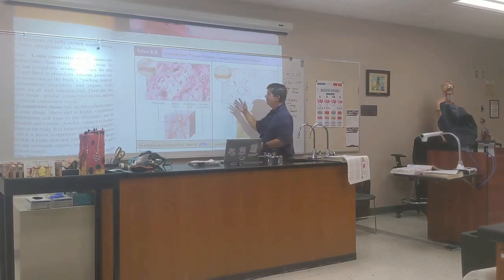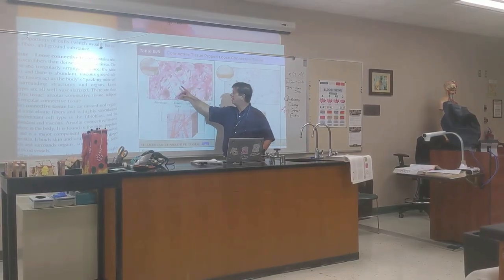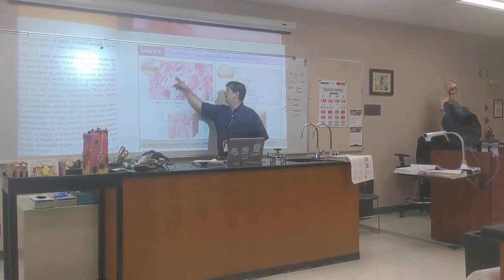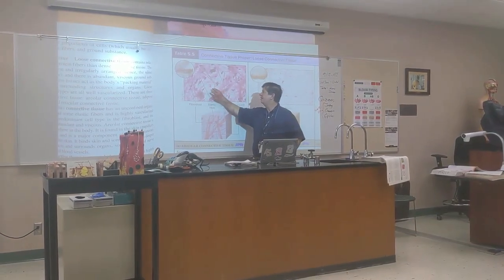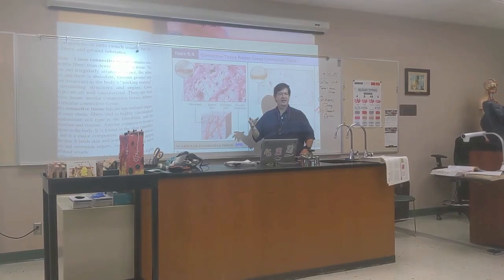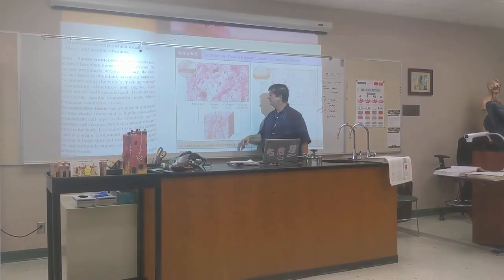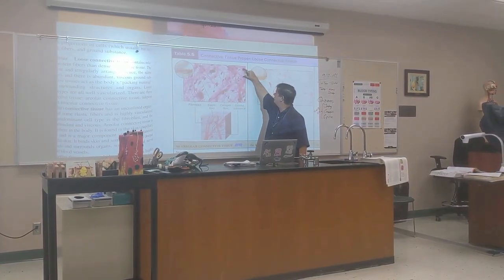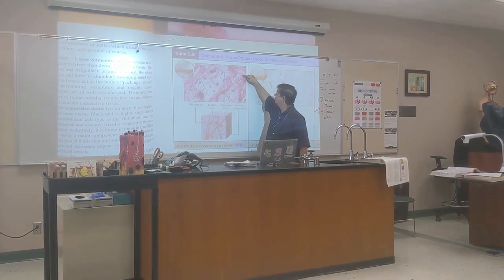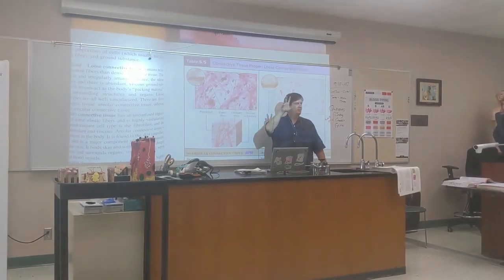But this is areolar connective tissue, and it looks very open, like there's nothing there. Like you've got fibers for sure, and you've got specialized cells living there. This is not nothing. This is not air. This is ground substance. There are things there. Does that make sense? But it's got a lot of space. And when you look at this areolar connective tissue, it has elastic fibers, it has the bigger, thicker collagen fibers. See how here the elastic fibers are thin, little stretchy things, and then the thicker ones, those are the collagen fibers. Everybody good with that?